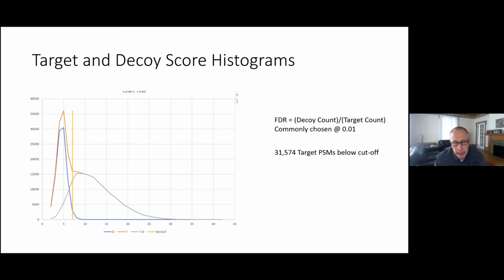I don't find them very interesting or useful. I'm more interested in the peptide lists, because that's the reduced list of unique peptides. And that's what we use when we're doing protein inference, which we're often interested in doing. PSMs don't factor into protein inference, okay? Only the peptides factor into protein inference, so they're not all that useful.